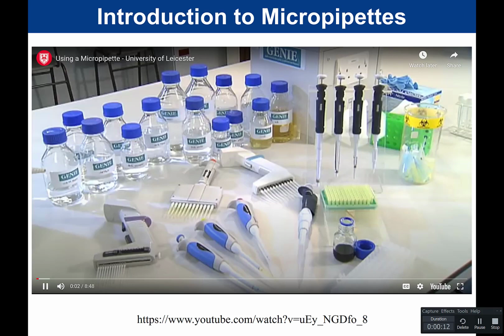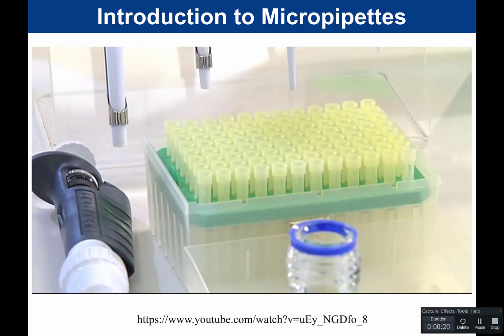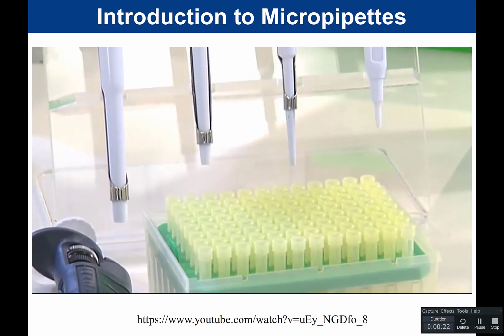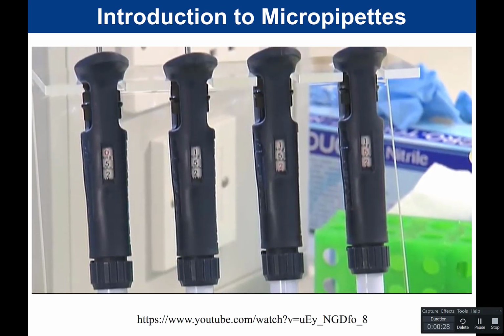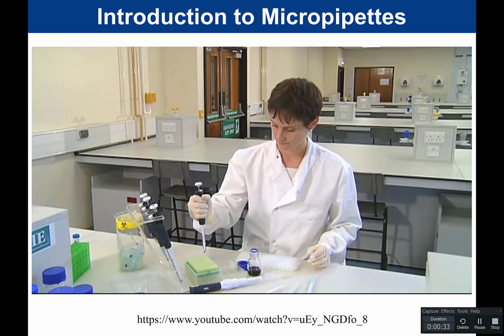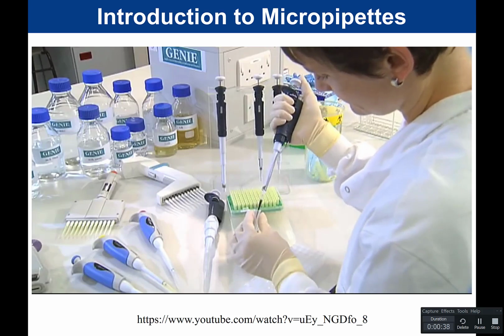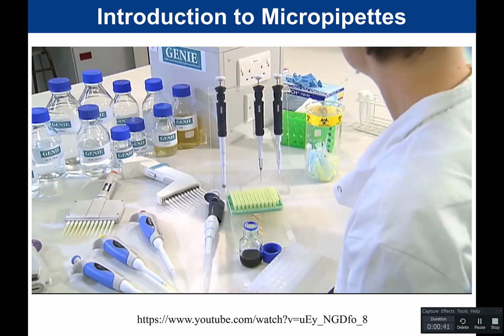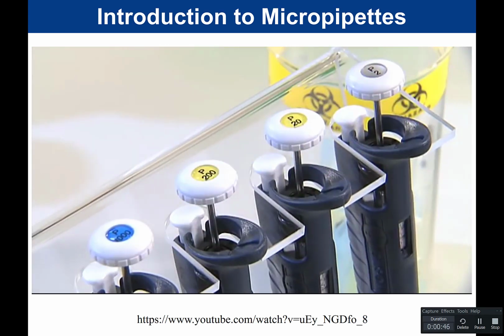Gilson or similar micropipettors are one of the most commonly used instruments in a molecular biology laboratory. They're used in conjunction with plastic disposable pipette tips to measure or transfer small amounts of liquids, usually from 0.2 microliters to 1,000 microliters or 1 milliliter. Different pipettes work across different ranges of volumes and are named by the maximum volume they pipette. The different pipettes look very similar, so they're labelled on the top of each push button with a capital P followed by a number which indicates the maximum volume for that particular pipette.